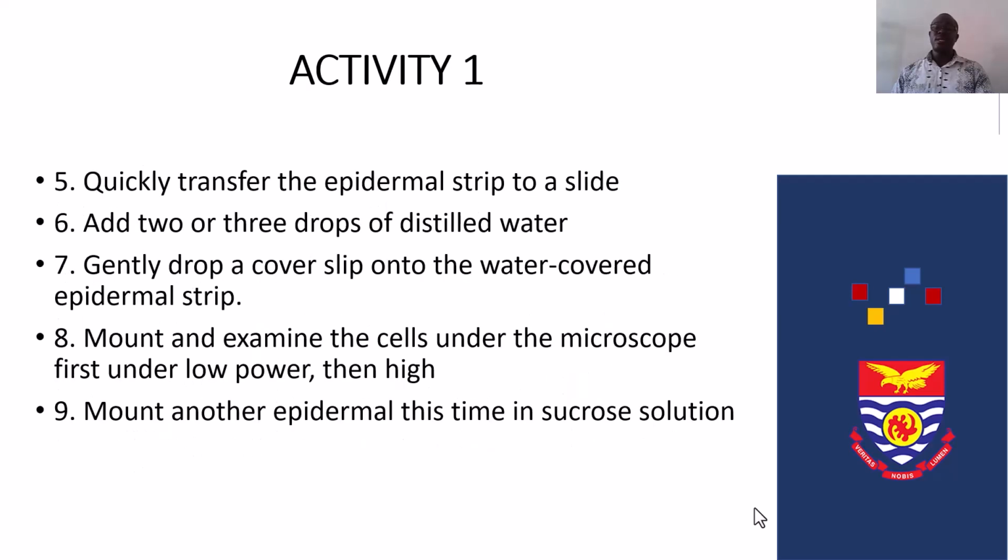Quickly transfer the epidermal strip to a slide. Add 2 or 3 drops of distilled water. Gently drop a cover slip onto the water-covered epidermal strip. Mount and examine the cells under the microscope, first under low power, then high power.